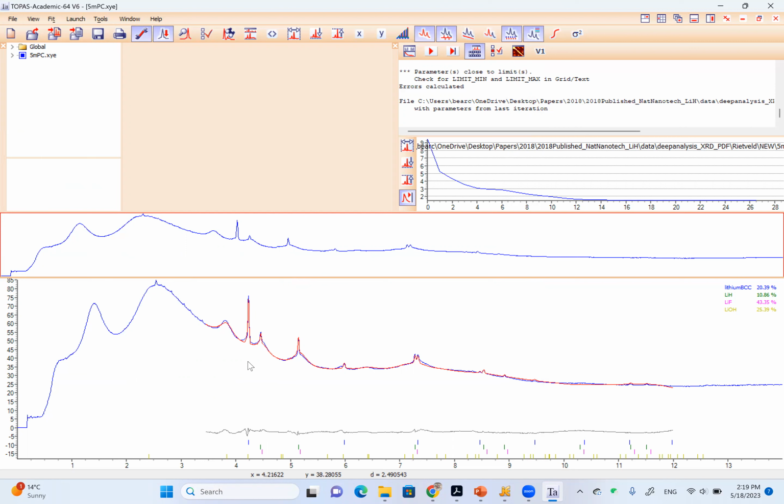And we must recognize this is a very unique thing. You're using a very advanced synchrotron. You're exposing your sample on the order of 10 minutes to even 20 minutes without any filter. It's full flux. It's an enormously long exposure. And eventually, the count you get for the strongest peak is only around 30.